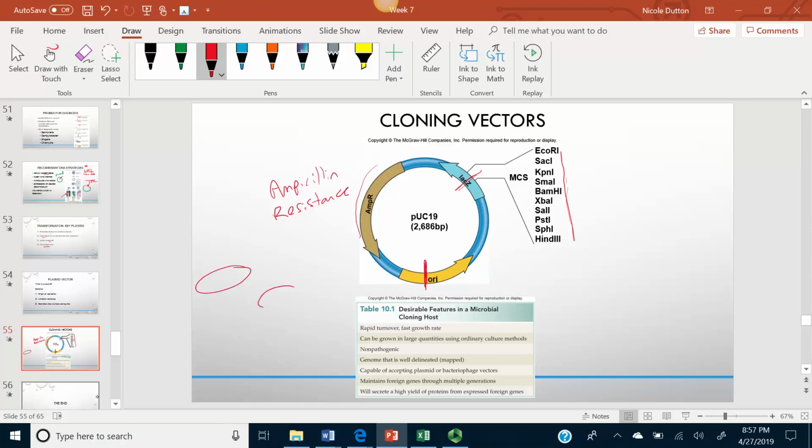So let's say we have bacterial cells in a tube. And then we have the tiny little plasmid DNA that have been made, and they're floating around in the tube next to the bacteria. Through the process of heat shocking, some of these will go into the bacterial cells while the rest of them stay out. Now at the end we have some bacterial cells that don't have the plasmid and some bacterial cells that do. In the end, we only want to grow the ones that actually got the plasmid. So how do we kill off the ones without the plasmid?